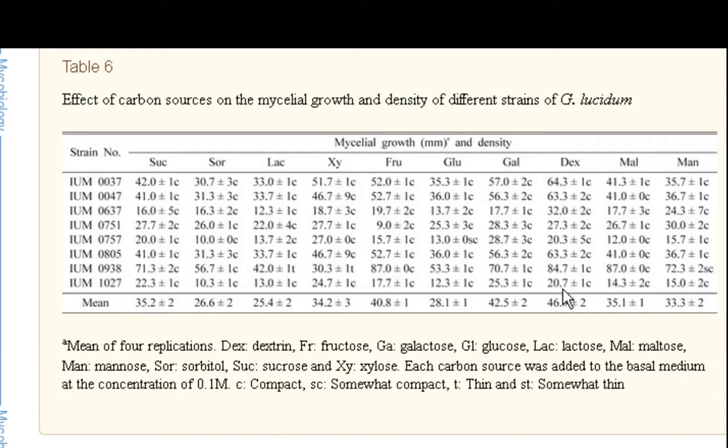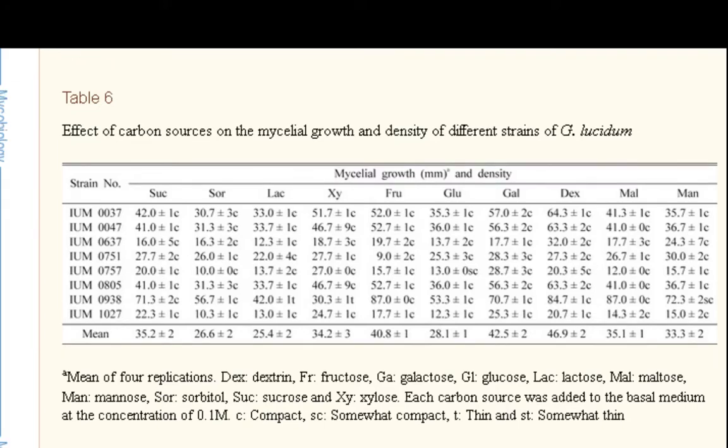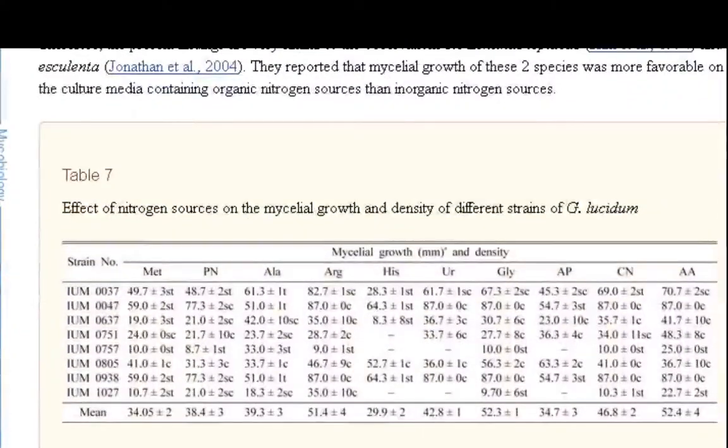They're going to be a little less. Maybe I'm going to be in the 35 range for average growth for everything here. That's my guess. So I just wanted to add that list in there and show you that I am studying all of these different types of mediums.